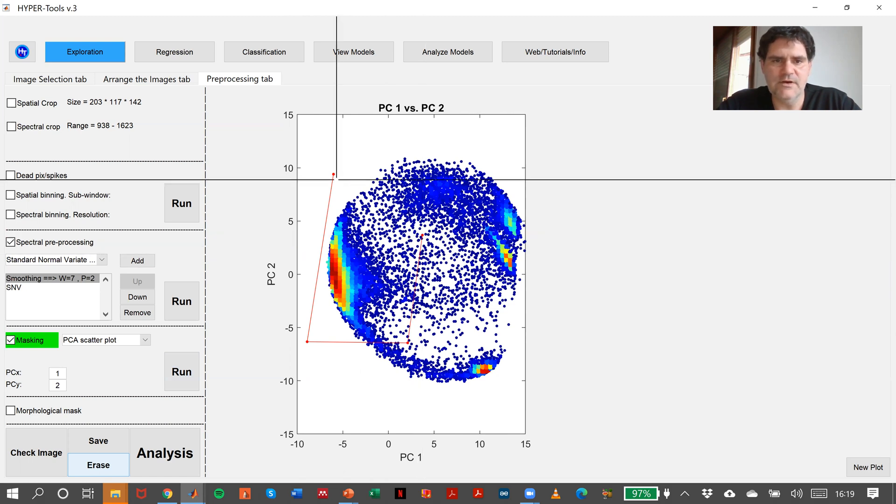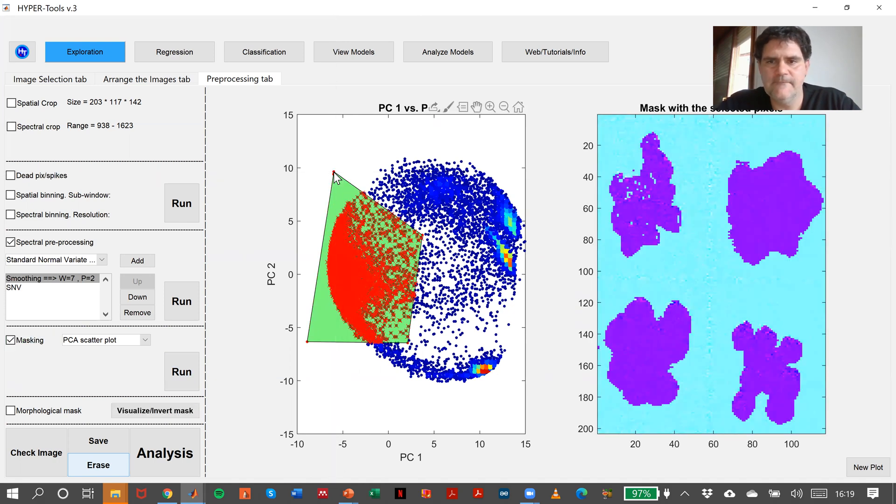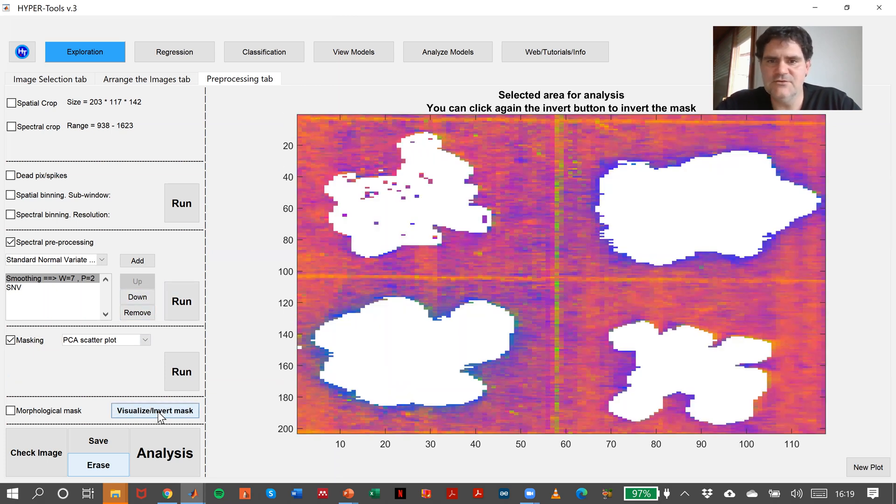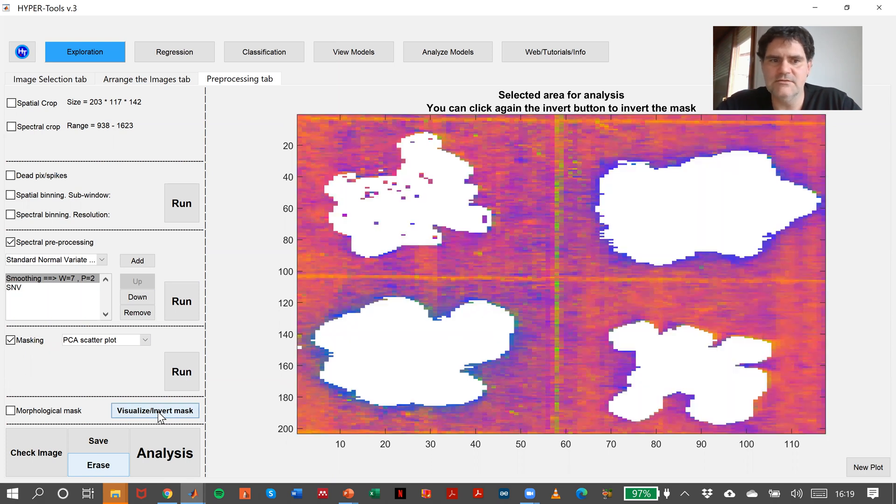And this one here. There we are. Look at this. This is actually the background, and these are the plastics you want to analyze.